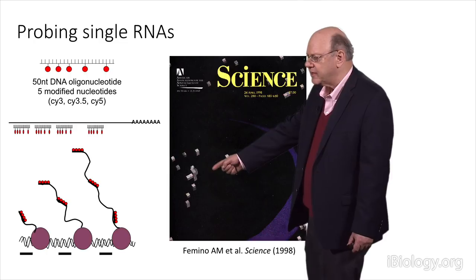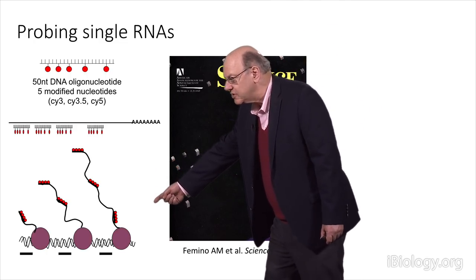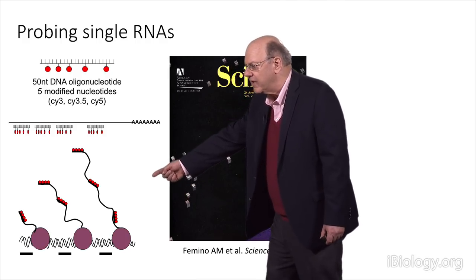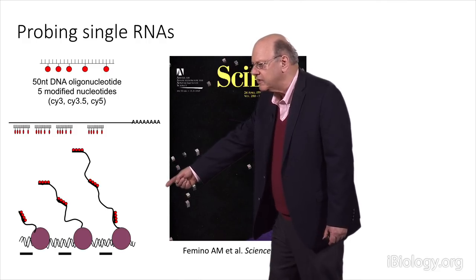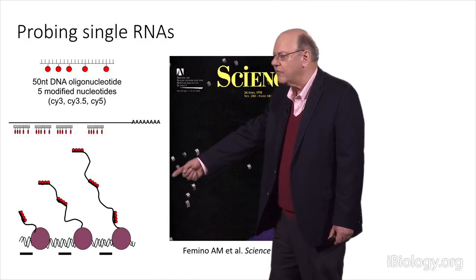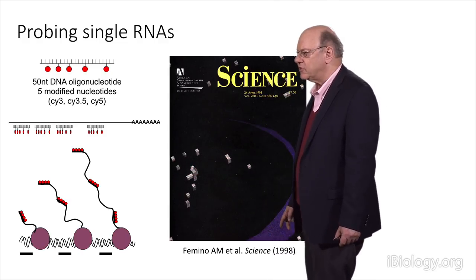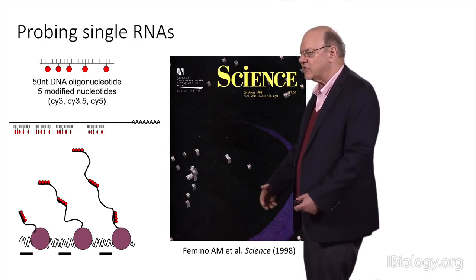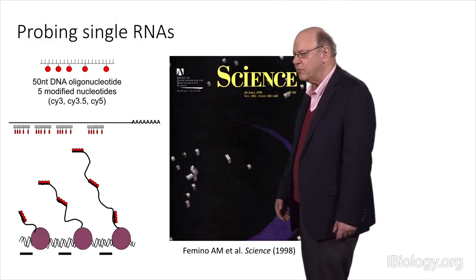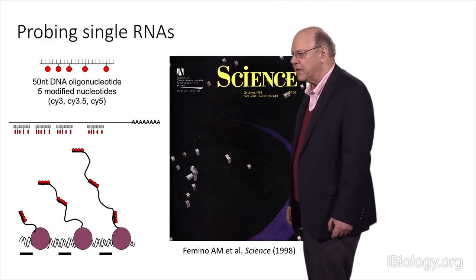And the reason it's so bright is because the polymerases that are lined up on the gene making the nascent RNA chain are closely compacted on the gene, and therefore there are many RNA targets at that site. The most intense concentration of RNA you can find in the cell is actually the site where RNA is being born, because that's a fountain of RNA that's being produced there.